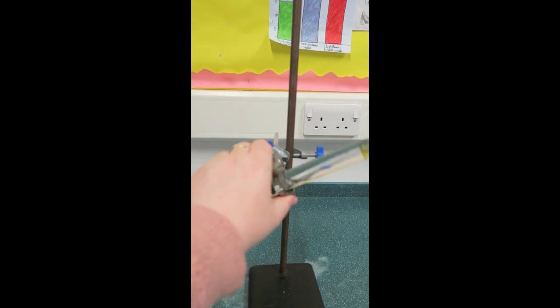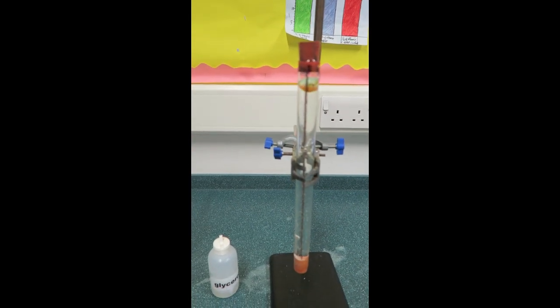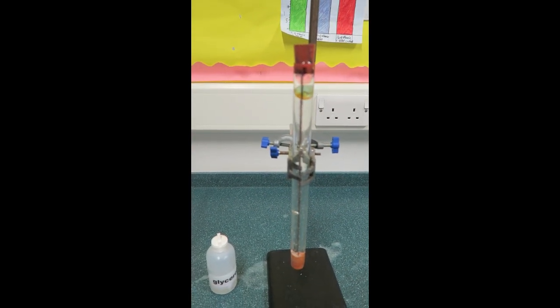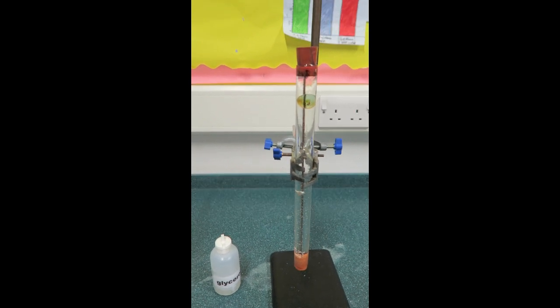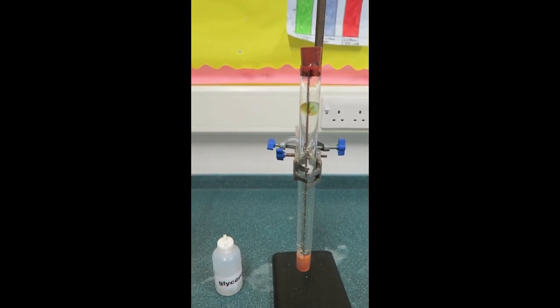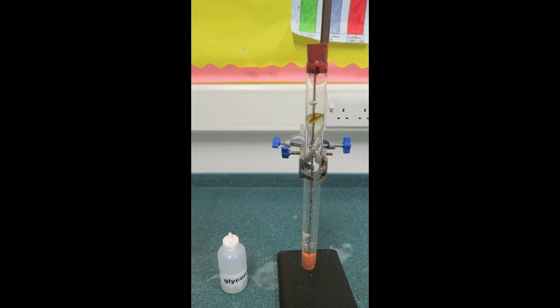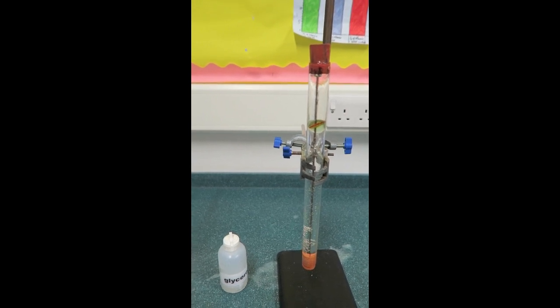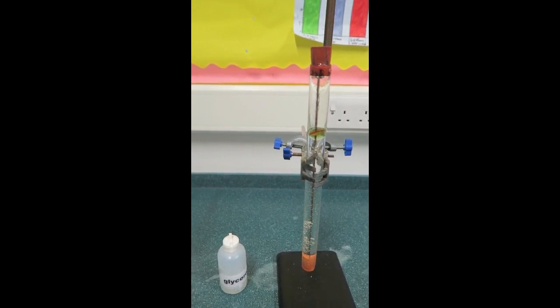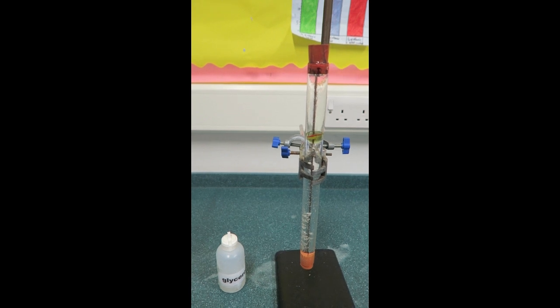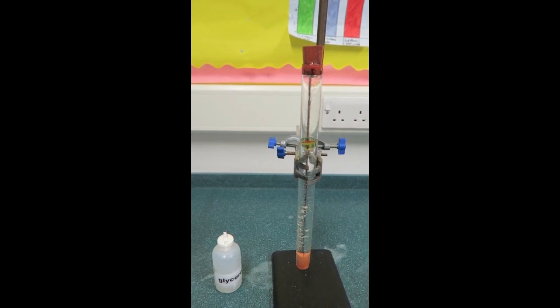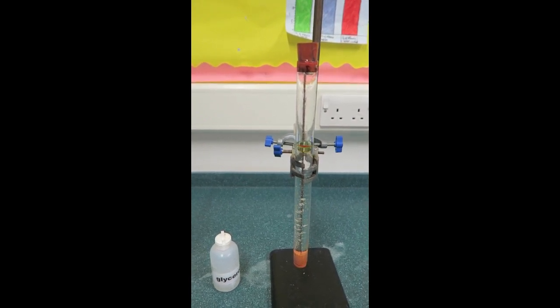This experiment was repeated with glycerol. Glycerol is propane 1,2,3 triol. Glycerol contains 3 OH groups. This means that it has a significant amount of hydrogen bonding between its molecules, unlike water which only has 2 OH groups. This means that the time taken for the marble to fall through the tube is much longer for glycerol than it is for water.